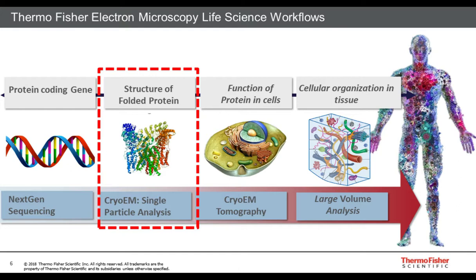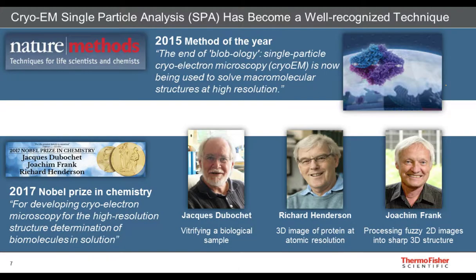For now, in this presentation, again, I will focus on what I mentioned already, single particle analysis. That the technology has become very well recognized in the last couple of years has already become clear if you have read the literature. In 2015, single particle analysis was awarded Method of the Year, mainly because of what is called the resolution revolution, the sudden increase in obtained resolution of proteins and protein complexes due to some very differentiating technologies, which I'll get back to later on.